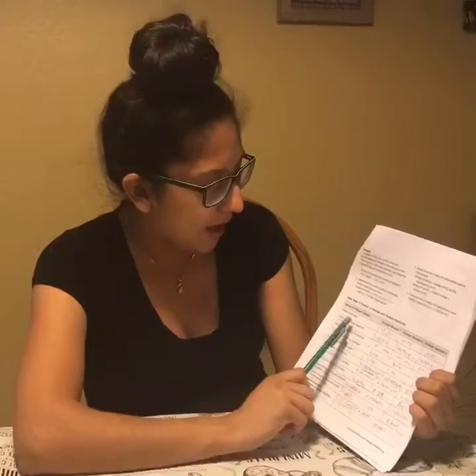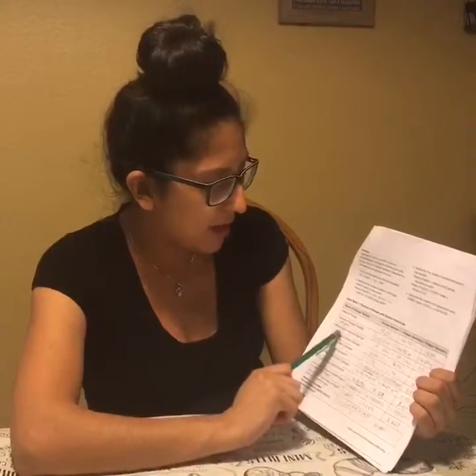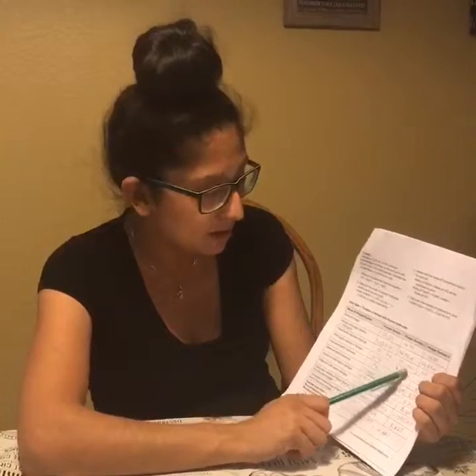For lab number 6, for data table 1, the titration of vinegar with sodium hydroxide, vinegar samples 1, 2, and 3 were pretty much the same: the mass of the vinegar was pretty much the same for all 3 of them. So was the volume of the vinegar density. The initial volume was the same because in all of them, the syringe was 10 milliliters.